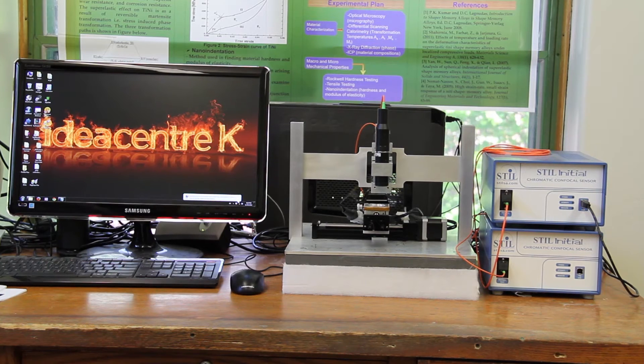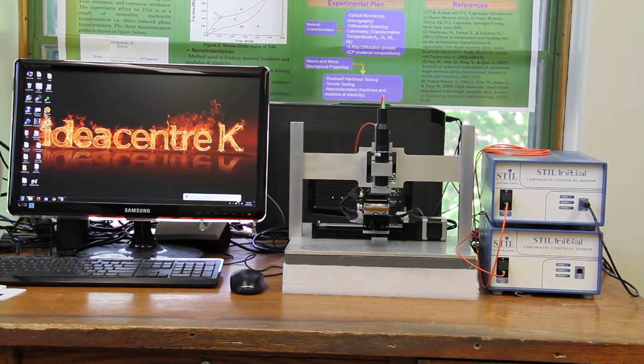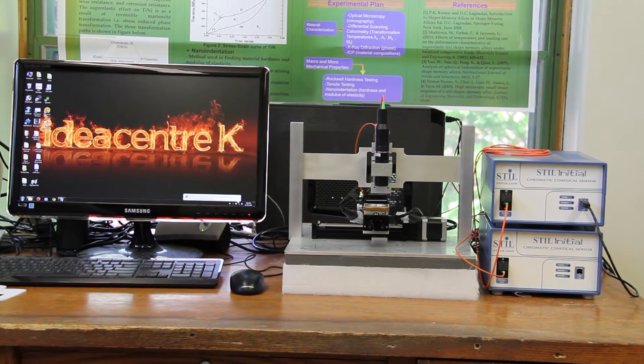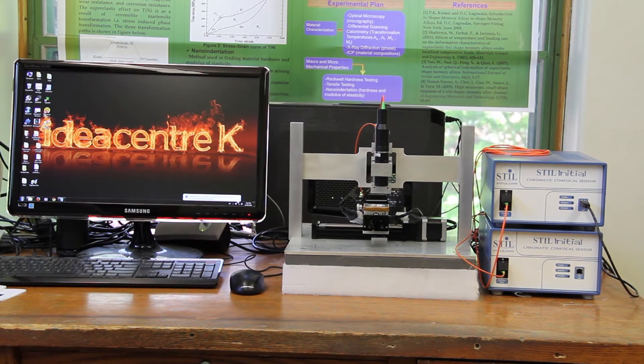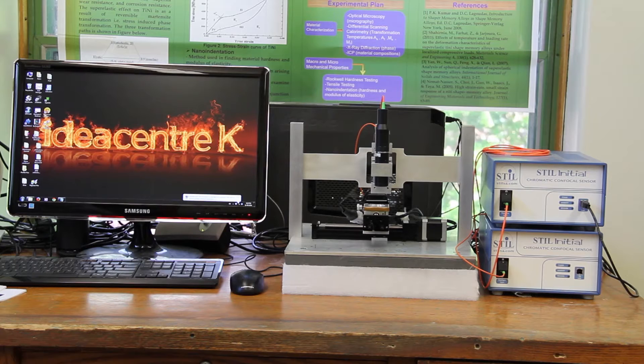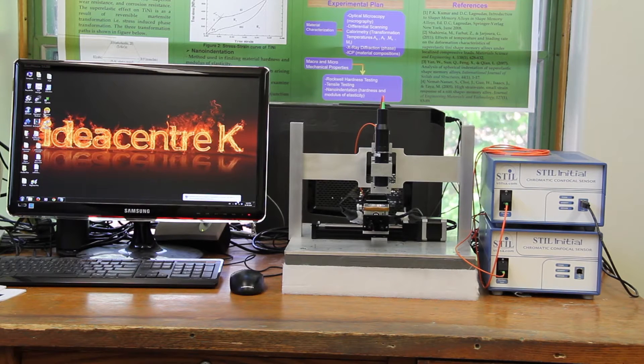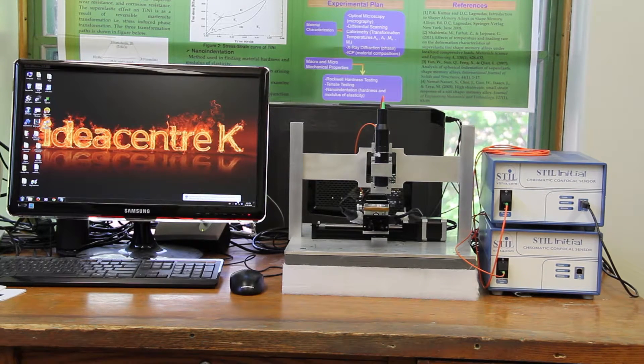This is the optical profiler that we have in our advanced tribology laboratory. Today we are going to demonstrate how to operate this machine.